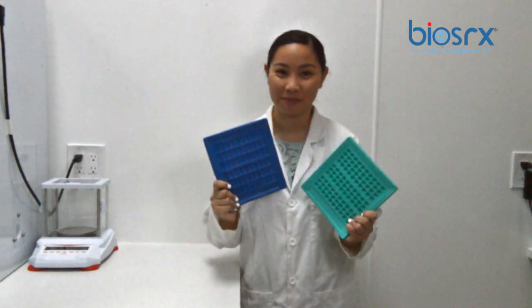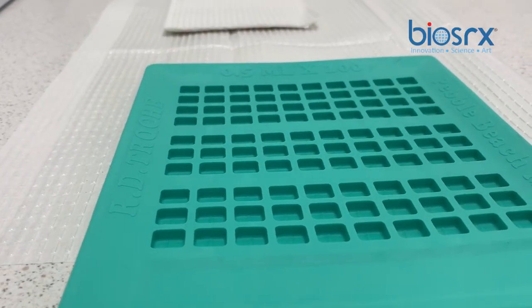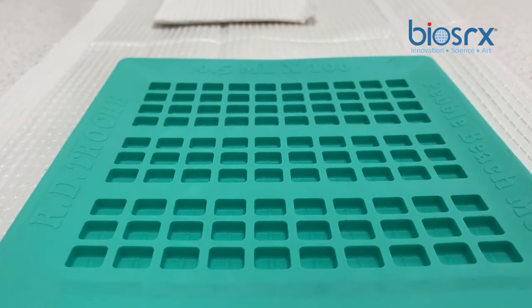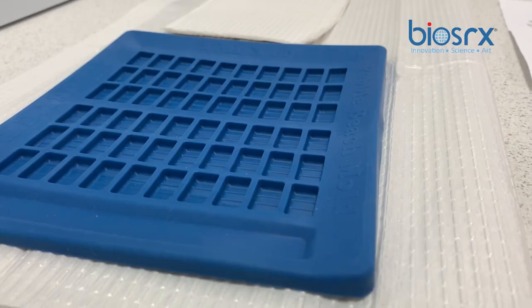So far, these molds have made my compounding experience easier and simpler. The first thing I want to talk to you about is the material that these molds are made out of. They are made of an FDA-grade thermoplastic elastomer, which is a technical term for a very durable rubber.